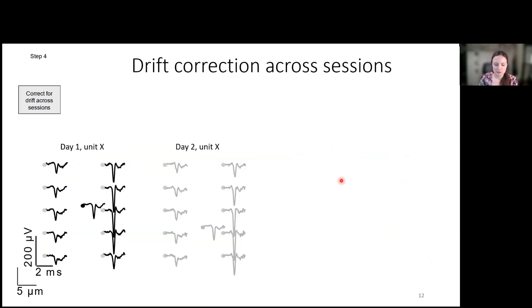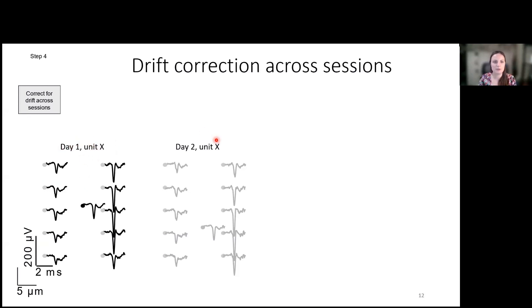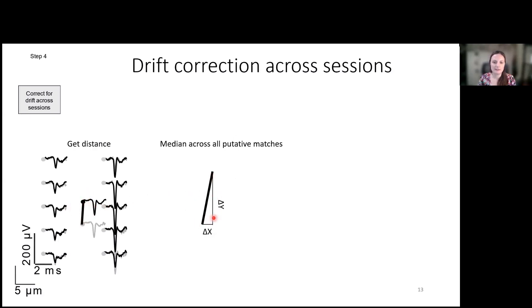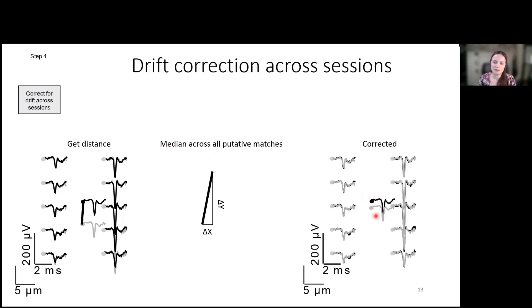First, we run into a problem that has already been described: there might be drift across recordings, which we need to solve because we don't stitch the recordings and therefore cannot track drift across recordings. So we first use this putative set of neurons to find how much drift we have. We look at unit X — presumably the same unit on day one and day two — and calculate the delta X and delta Y displacement. We do this for all putative matches across days, take the median, and apply median drift correction to the entire dataset. Then we repeat the first three steps with these drift-corrected data.